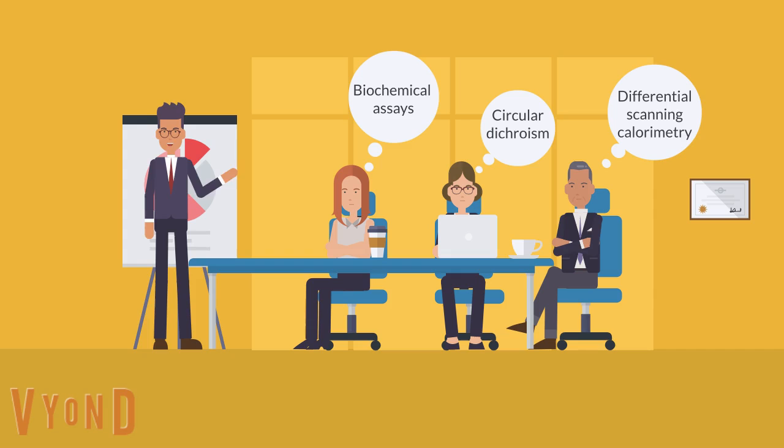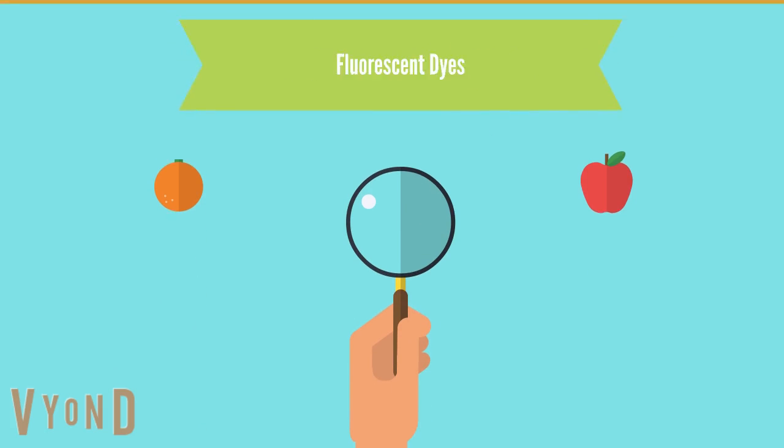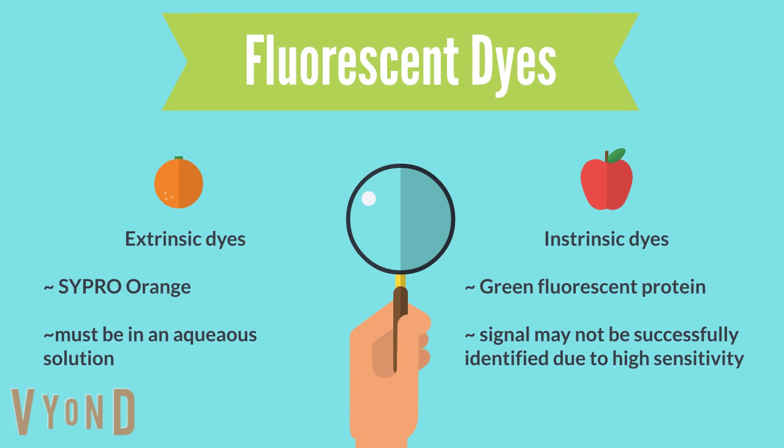Both circular dichroism and differential scanning calorimetry require a large amount of pure protein to work with, and they are low throughput options. One thing to consider when you're conducting a DSF is which type of dye to use, and that totally depends on your protein, whether you choose an intrinsic or an extrinsic dye.